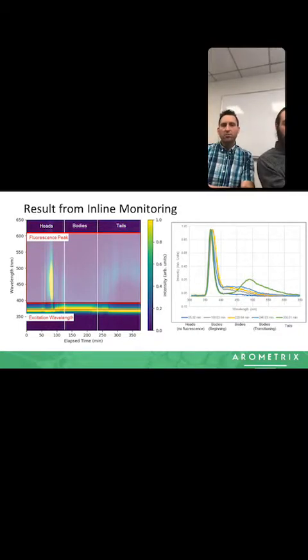They did not clean the glassware. And so what you're actually seeing is that the new heads are washing the old tails out of the system. So this is all of that chemistry collapsing out into the heads flask that's being collected. So that was really cool that we were able to see that, and we were able to see it wash out all at the same time.